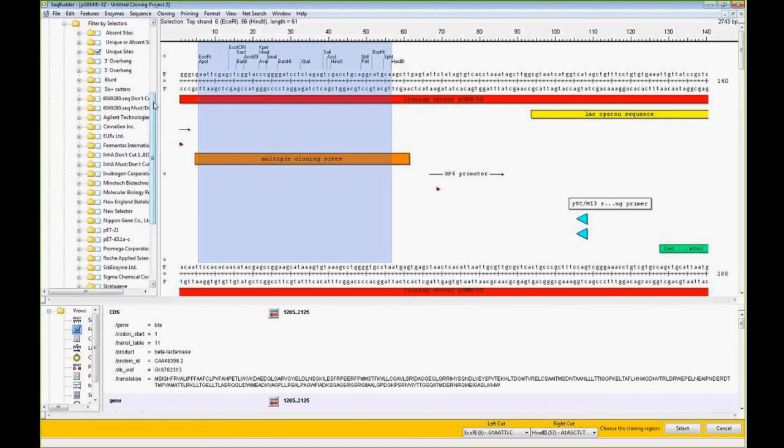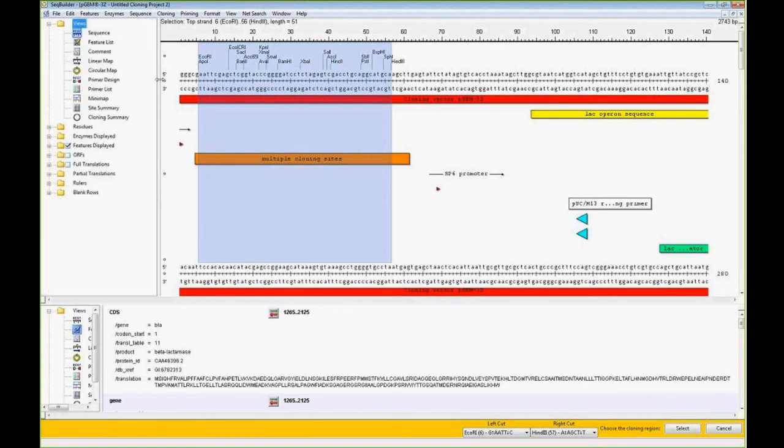So if you want a specific enzyme type, like 5' overhangs, 3' overhangs, blunt cutters, or absent sites, you have the capability to create a selector based on whatever criteria you specify. The enzymes built into the software are from REBASE catalogs, such as the New England Biolabs restriction enzyme catalog, but you have the ability to create whatever selectors you utilize.